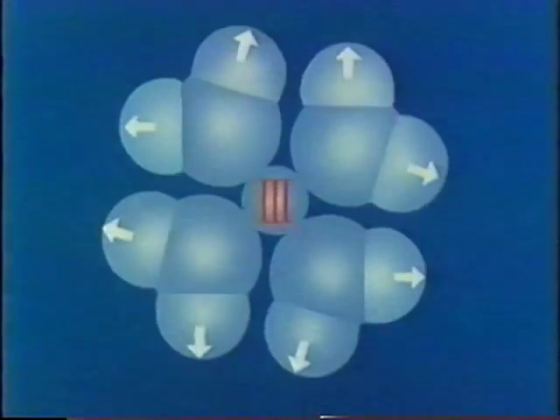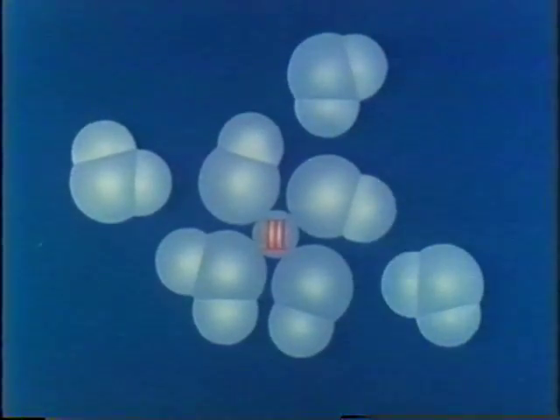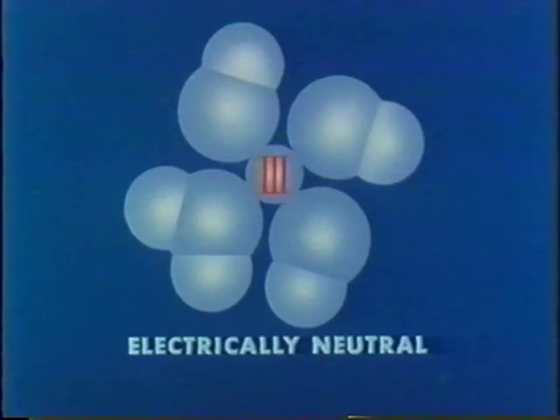At the start of the experiment, the vanadium-3 ion is strongly bonded to water molecules, 4 of which are schematically shown here in 2 dimensions. The positive vanadium repels the hydrogens. The added hydroxide ions remove hydrogen ions from the water molecules, leaving hydroxides bonded to the vanadium. This combination of negative hydroxide and positive vanadium lowers the positive charge of the aggregate. The precipitate forms when the aggregate becomes electrically neutral.